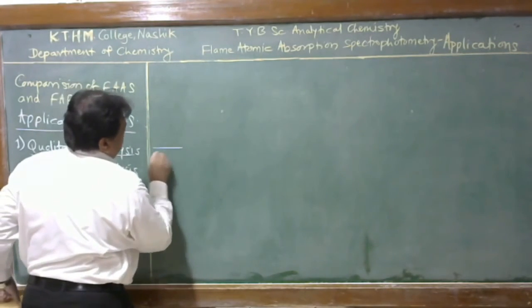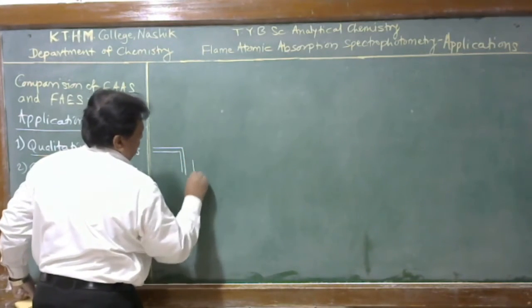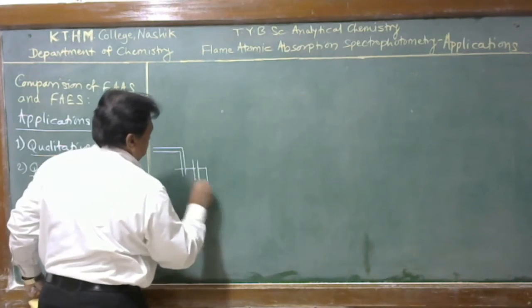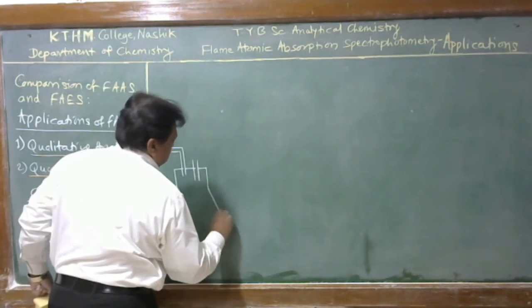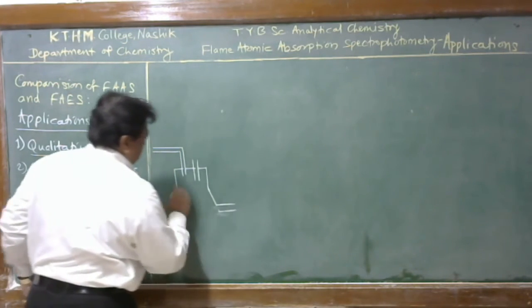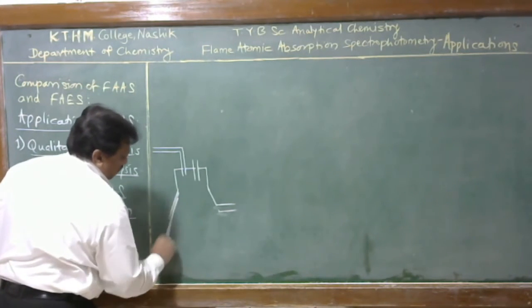For determination of mercury in different samples, mercury is taken into a reaction mixture vessel.